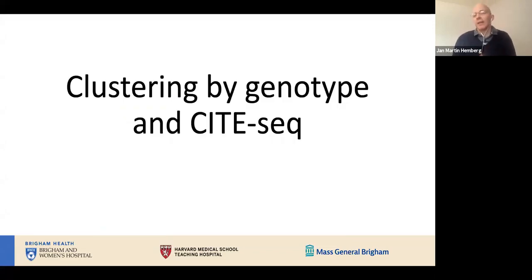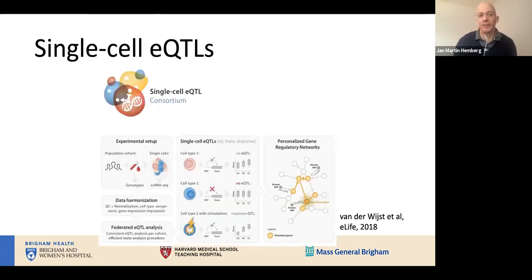Right. So in this last section, I'm going to be telling you about two other types of applications, which are not directly linked to the expression matrix or the count matrix, but they're nevertheless very useful, and it's important to know about them these days.